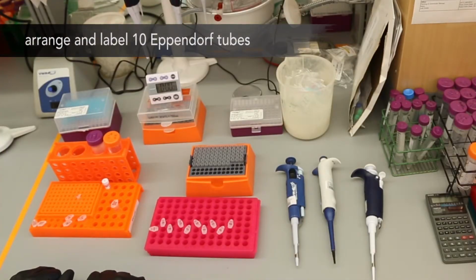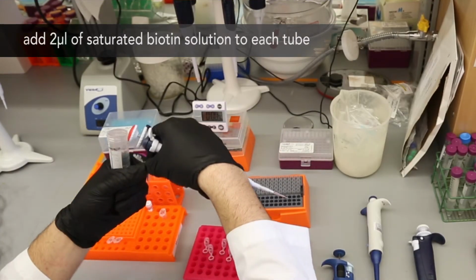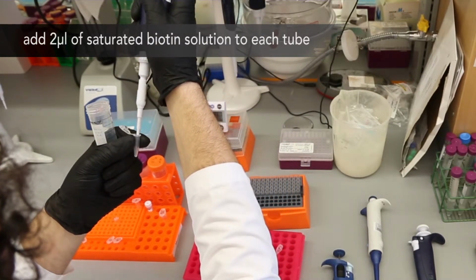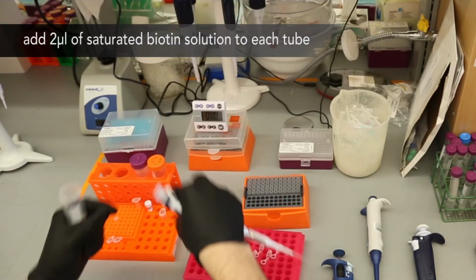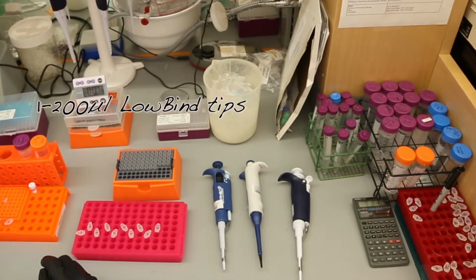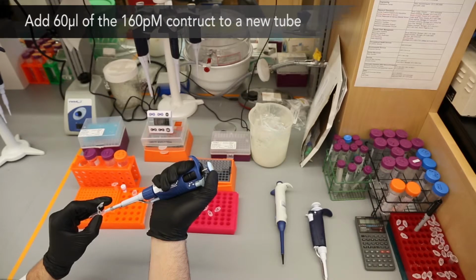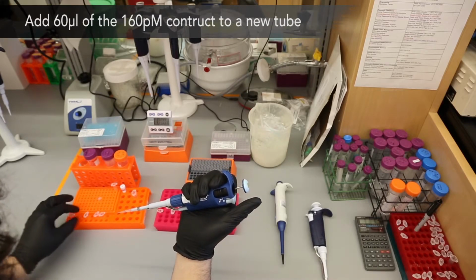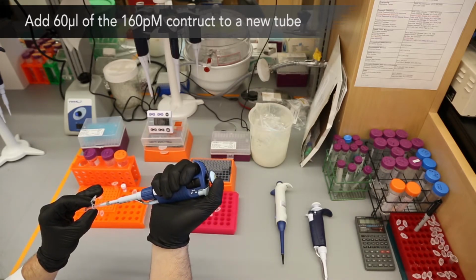10 Eppendorf protein low bind tubes should be labeled and arranged in an easily accessible manner in a tube rack. 2 microliters of the saturated biotin solution should be pipetted into the very bottom of each tube. But during the on-rate experiment, it will help save time to leave all of your tubes open. We recommend having an ample supply of 1 to 200 microliter low bind tips and 3 pipetters at hand, 1 that can pipette 60 microliters and 2 that can pipette 10 microliters. Add 60 microliters of the 160 picomolar construct to a new protein low bind tube. Load tips onto all 3 pipetters and have them close at reach.